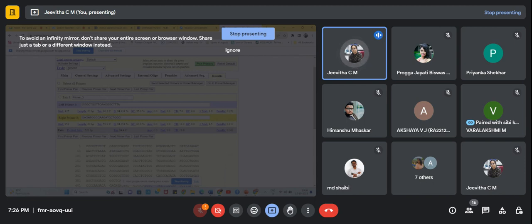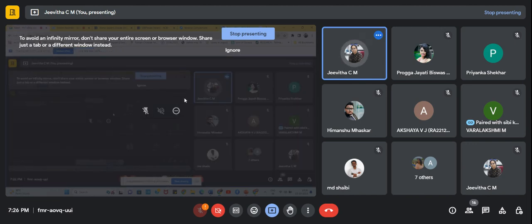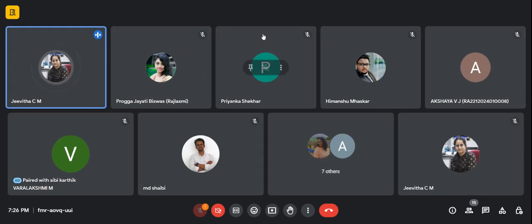So this is the basic thing when we are designing a primer, and this is how we have to verify whether the primer we designed is okay for our study or not. And these are the basic things we have to follow for all kinds of primer designing. It will be different for cloning, and for qPCR it differs. So we'll have separate sessions for that also. In the near future we'll have a separate session for NGS data analysis, and we'll also have one for cloning, and we'll also have one for machine learning.